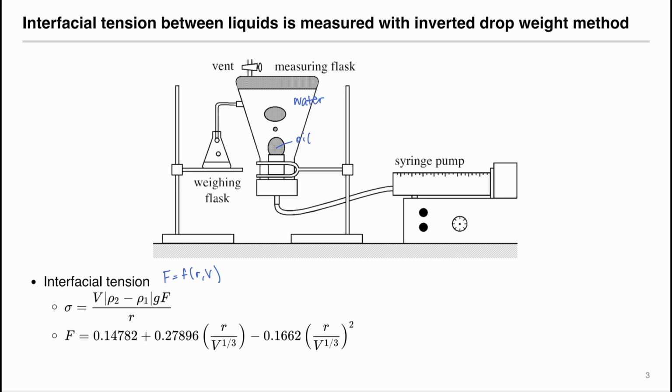The experimental setup is that we have a syringe pump filled with the target solution, in this case oil. The syringe pump pumps the oil into the device and through a nozzle, and after the nozzle the oil is broken up and flows up into the water. The vent is closed to make a closed system, and the displaced water has to flow out the side port.